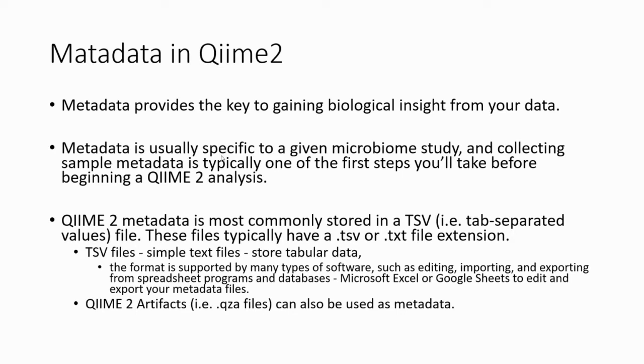Because in this QIIME 2 metadata, not only do you assign the sample name and correlate the sample file to the specific sample name, you also give all the other measurements and other data that you can put into the file. Normally it can be a TSV file or .txt.